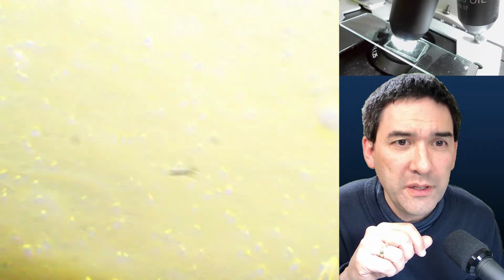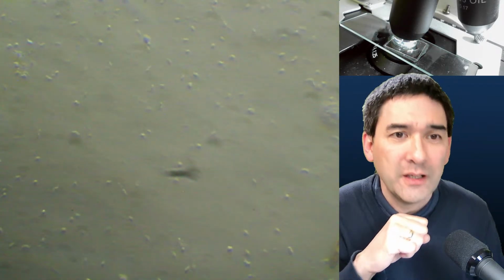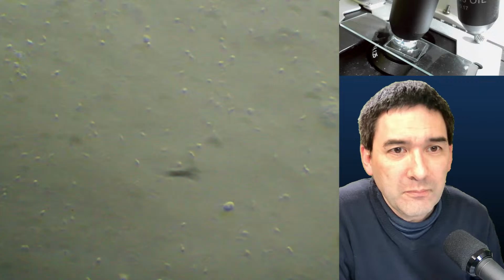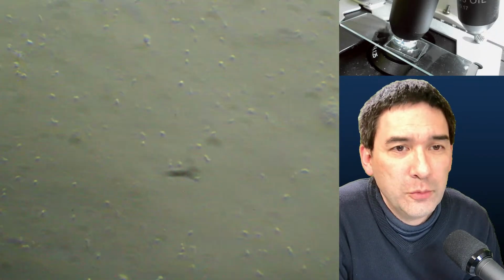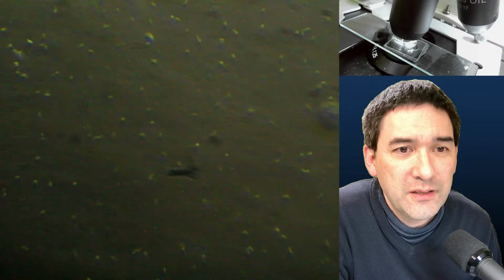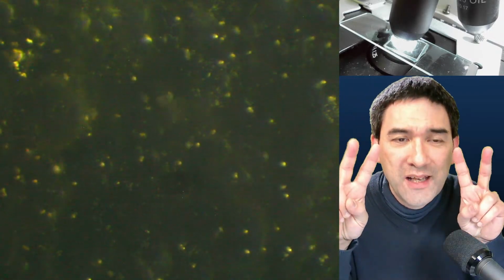If I open it yet further and go down with the light, then I should have oblique illumination. That's oblique illumination now. If you look at this right now, the image does not look quite as, in quotation marks, clean.